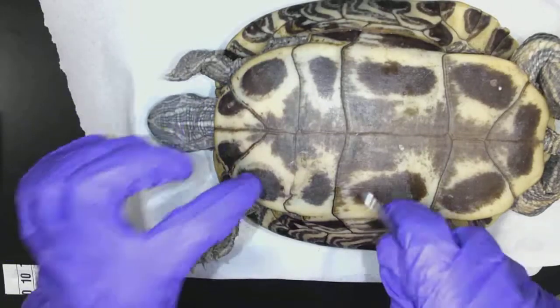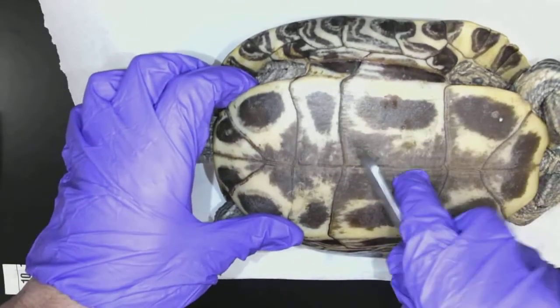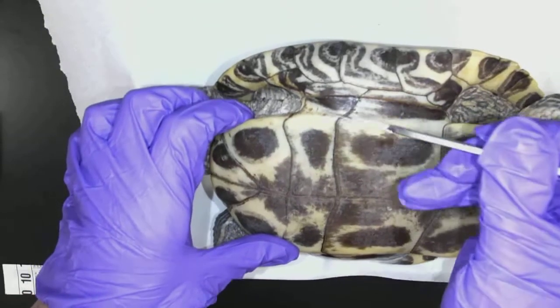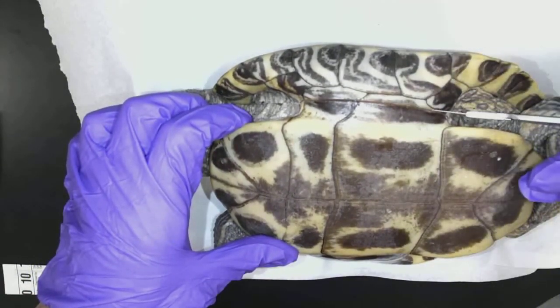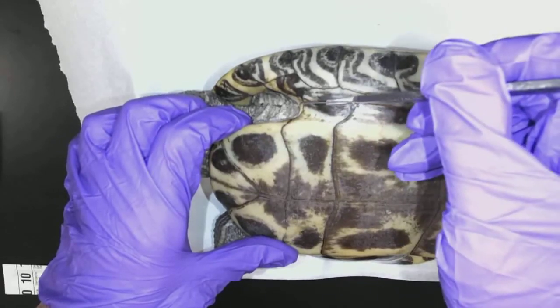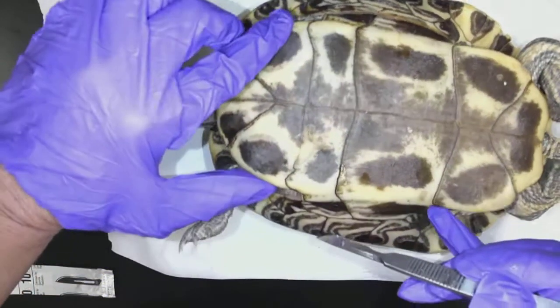To get into the turtle is pretty hard. We got this shell that we have to deal with. Luckily, the supplier has already cut using a saw through the bone of the shell here and here.